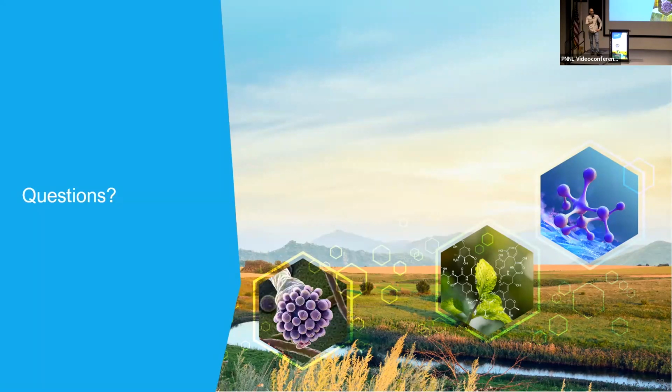But here, we can analyze organometals, for example, heme as one of the compounds. We can very easily detect them, for example, in soybean root nodules. So yes, it can be used for tracking siderophores or those kinds of compounds very efficiently. We already demonstrated, for example, heme B in the soybean root nodule, and how it's asymmetrically distributed there.